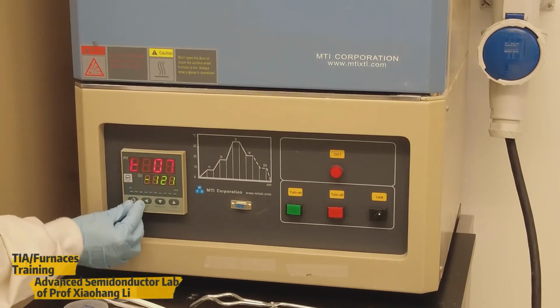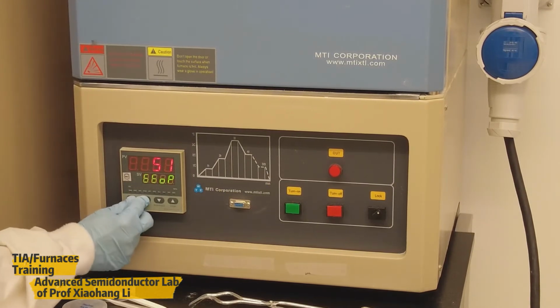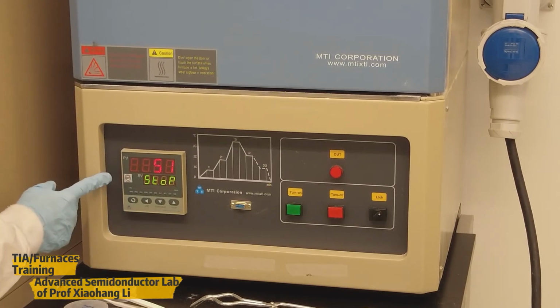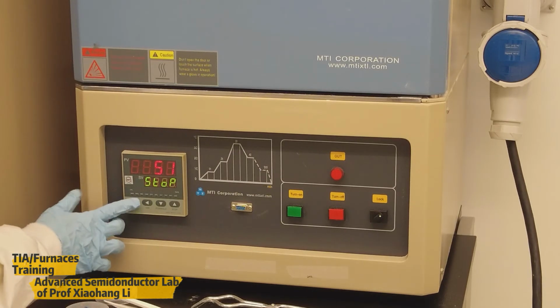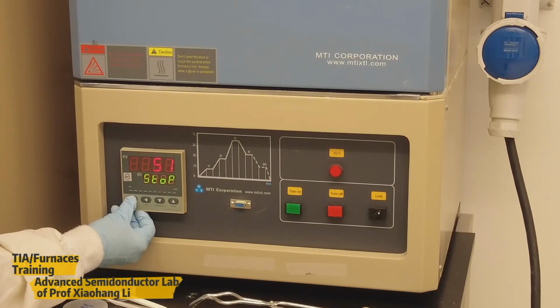Okay, then we'll push these buttons simultaneously so they can go back to the original status. Right now, we can check again with the same procedure.